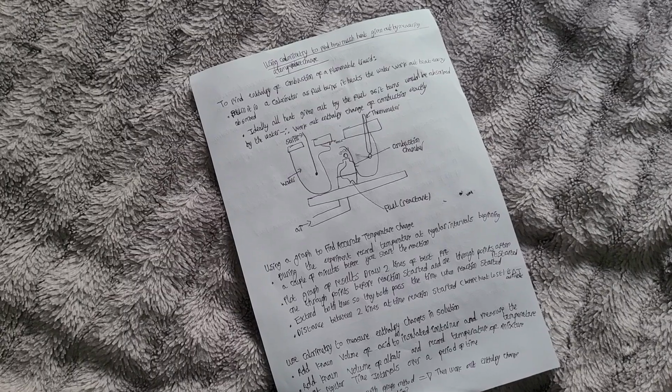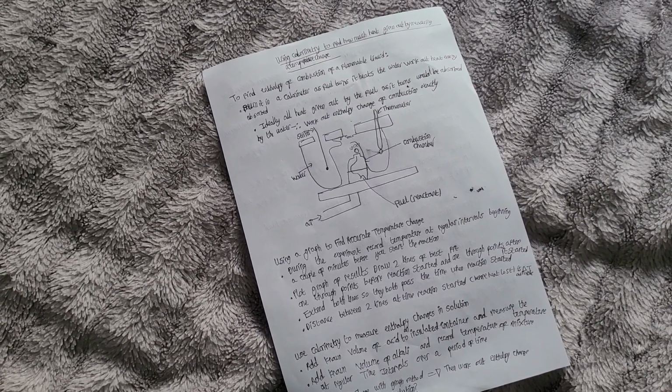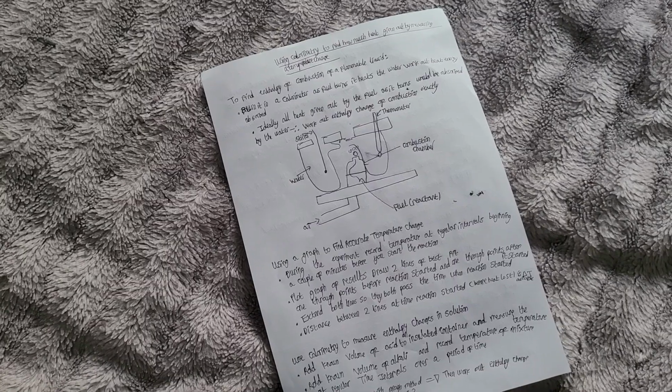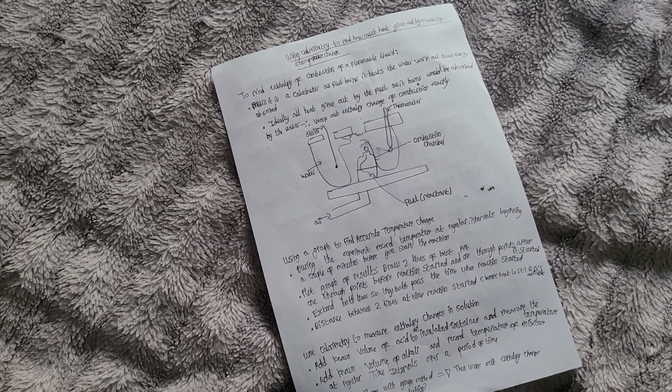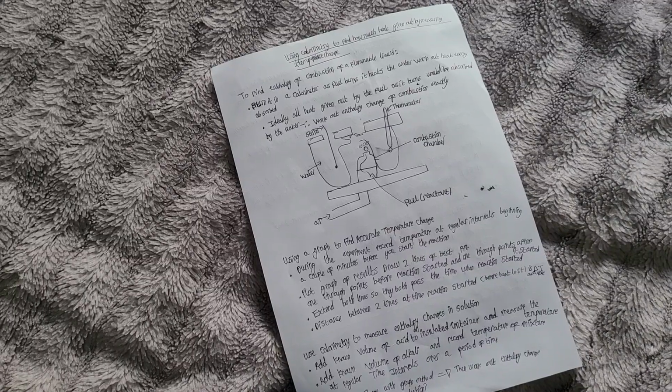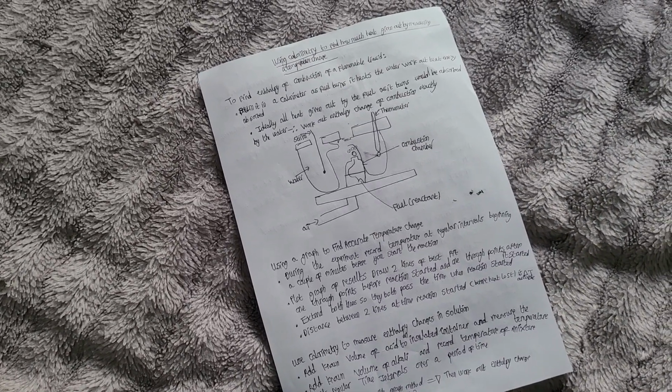One line of best fit through the points before the reaction started, and one line of best fit through the points after it started. Then extend both lines so they both pass the time when the reaction started.